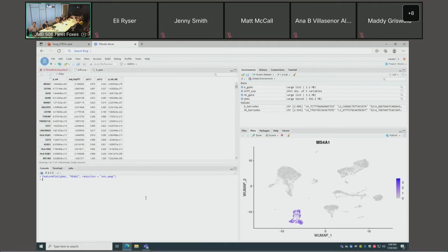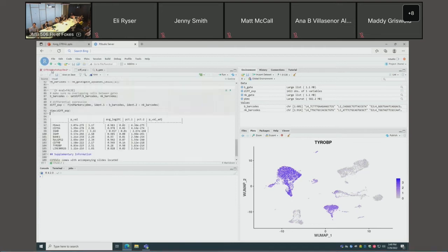And then for the others, for the flip side, this gene should be upregulated in the natural killer cells. Yep, so it's enriched in the NK cells as well compared to the B cells. Great. So that was an example of how you would use these gates metadata to help facilitate further downstream analysis. So in this case, it was just simple differential expression.